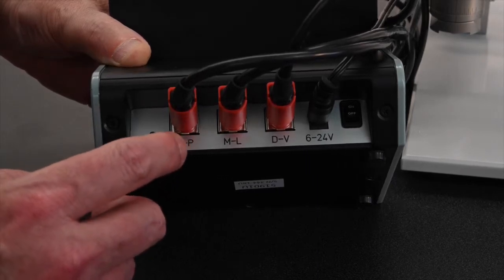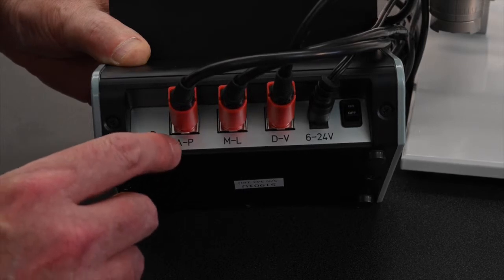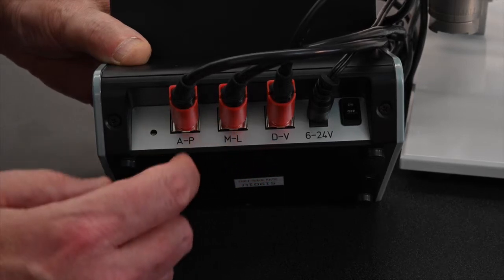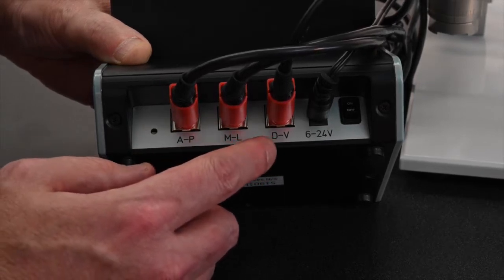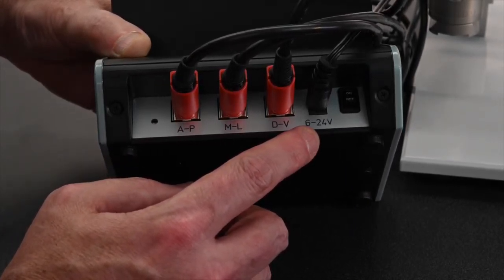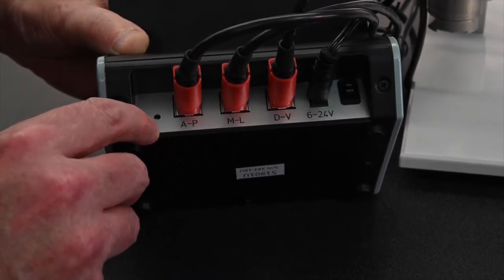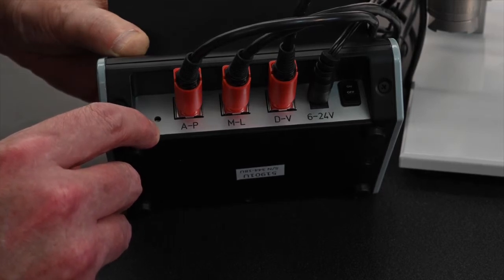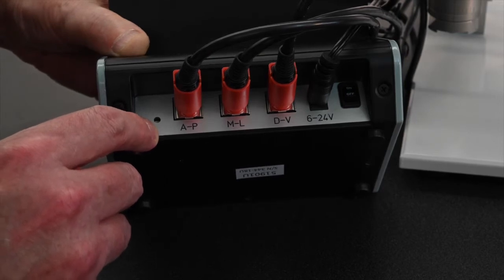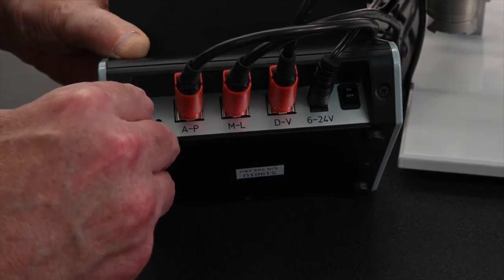Here is a view of the back showing the digital display touchscreen controller. You have the AP, ML, and DV ports in the back that correspond to the AP, ML, and DV drives on the stereotaxic instrument. The power port is 6 to 24 volts, which is included, and the power switch on/off is here to the right. This little hole is a power reset button — if the touchscreen is not working accurately, you can try sticking a paper clip in there to reset the display. Otherwise, please call technical support at Stolting and we'll be glad to help.